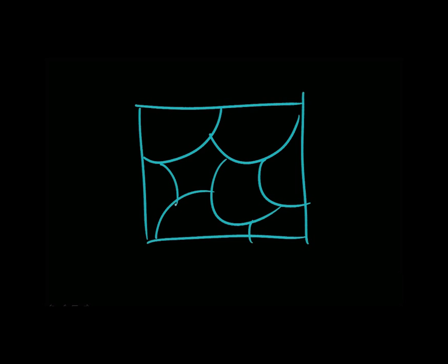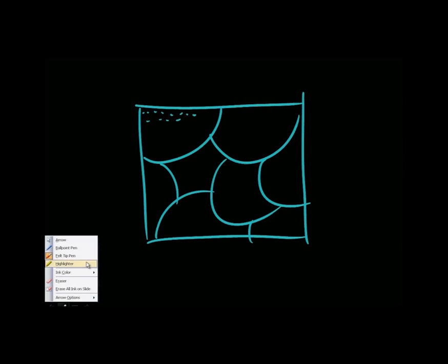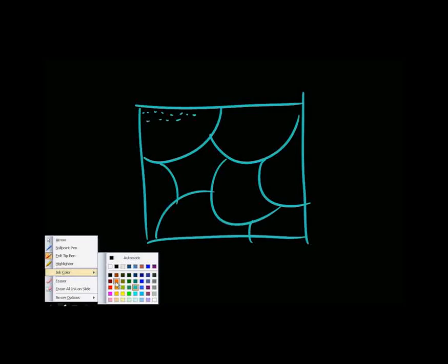Since it's scanning, rastering the electron across our sample, it looks at each individual point and records the emission spectra for each individual point. So what you get when you're done is something like this.